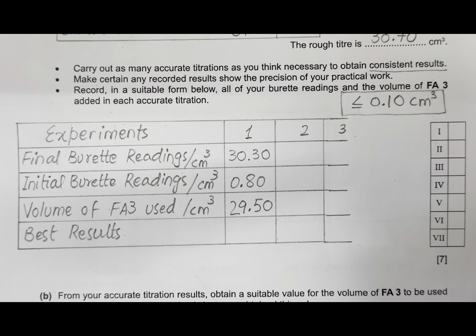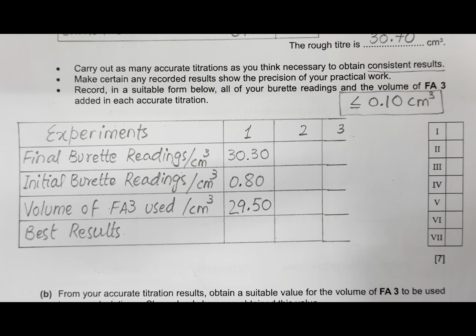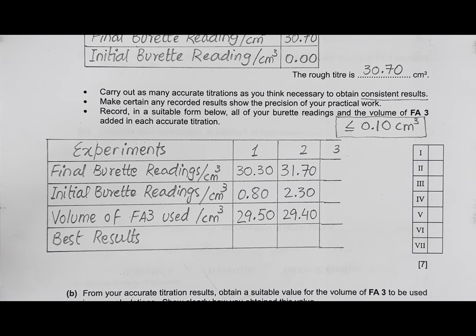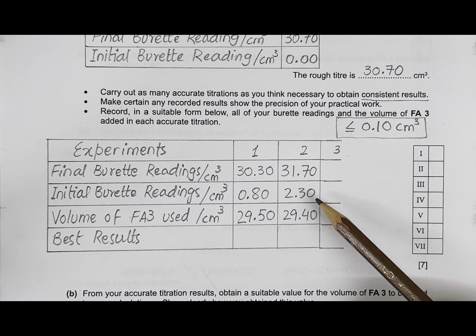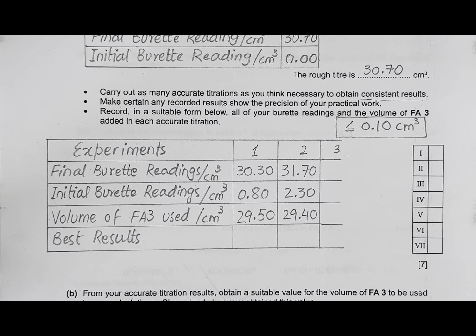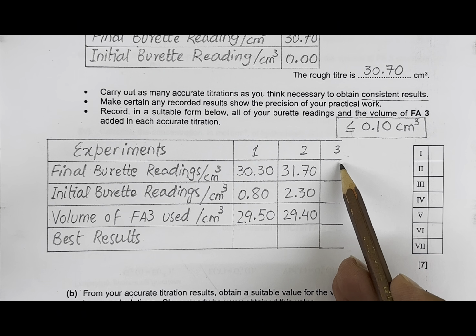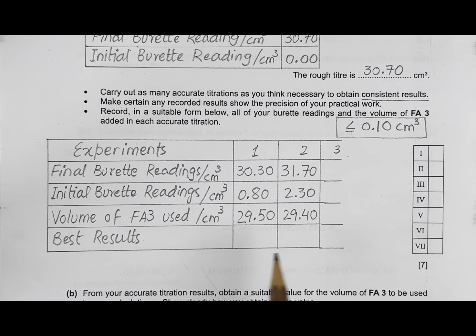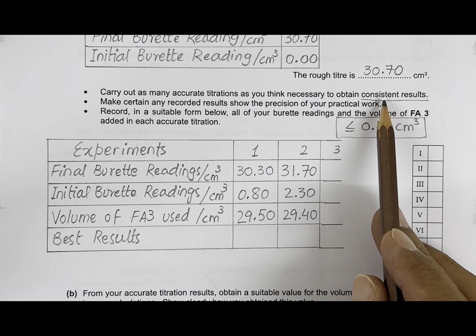Let me repeat the experiment one more time and see what accurate titration results come. Now when I repeated the experiment, I got in the second time these initial and final Burette readings, so the volume used is here. In this case now I do not need to repeat the experiment for the third time because the two values I got for the titer are not more than 0.1 apart. So I reached the level of consistency.